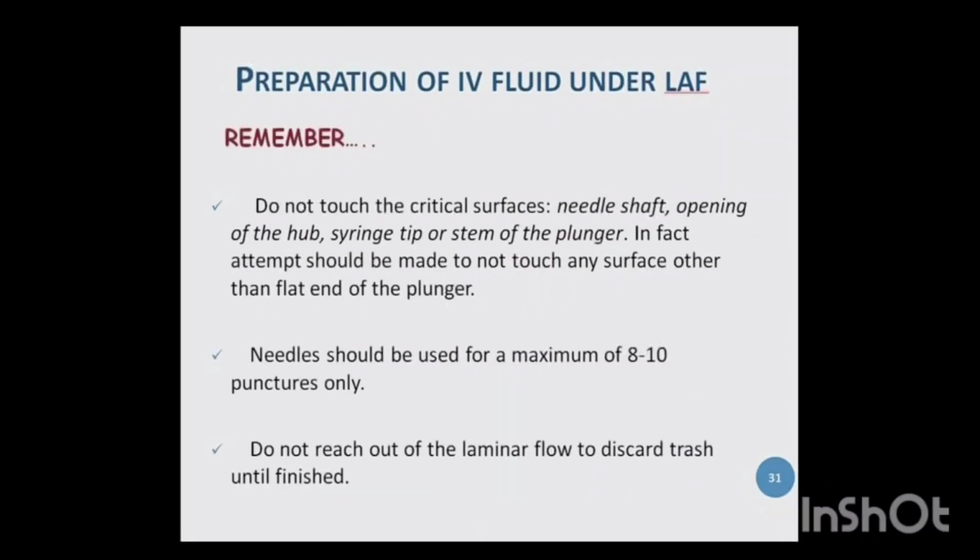Now remember, do not touch the critical surfaces. They are the needle shaft, opening of the hub, syringe tip, or the stem of the plunger. In fact, attempts should be made to not touch any surface other than the flat end of the plunger. Needles should be used for a maximum of only 8 to 10 punctures. Do not, we repeat, do not reach out of the laminar flow to discard the trash until finished. It is a good practice to use a bowl in which the extra fluid or the used needles can be discarded and kept within the laminar flow.